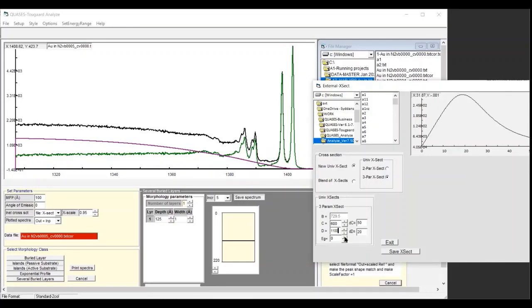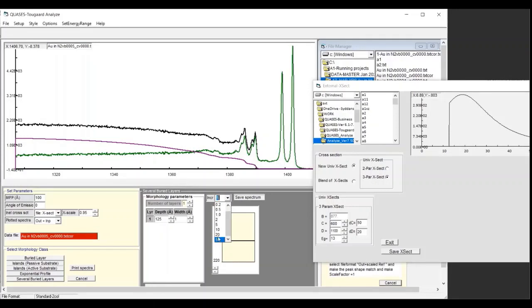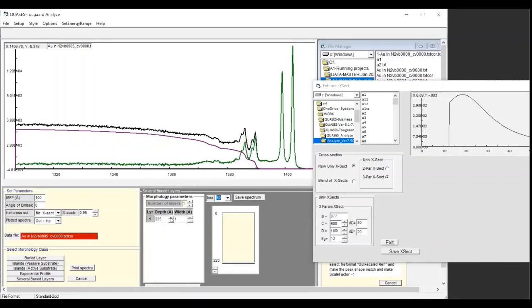We put in a gap, because we will have no excitations to the continuum up to about 13 eV, and after that we have these excitations. So we just take this one here, and let's see if we move this to 50 here. Let's see what happens. It seems to work fairly well out here.